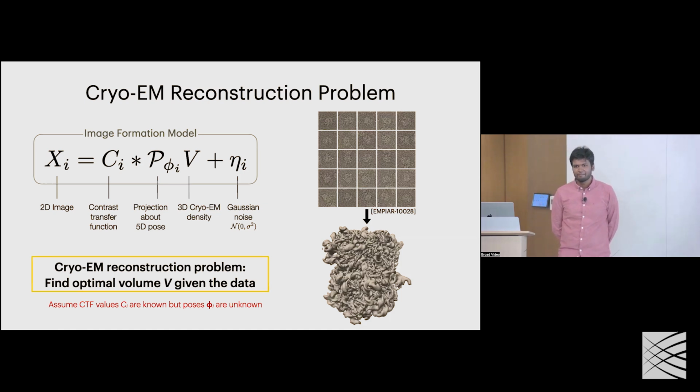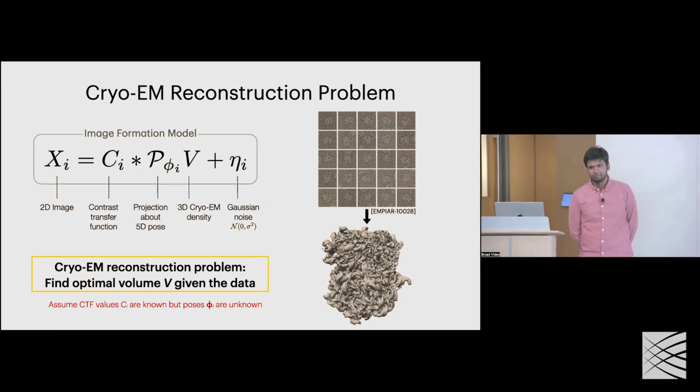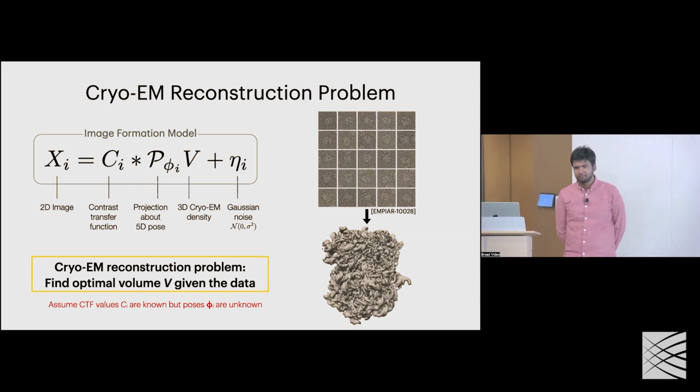So sorry, should I think of this as counts of how many times my imaging modality went through and hit the sensor underneath? Yes. So it's fully a positive kind of thing that I'm observing? Yes, it is an electron count. Interesting, okay, thanks.